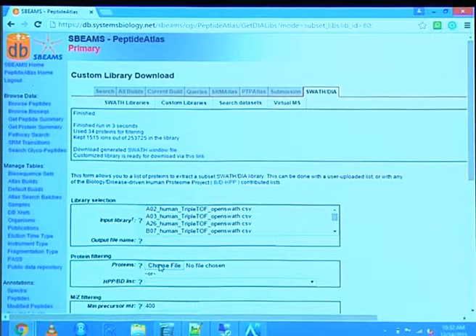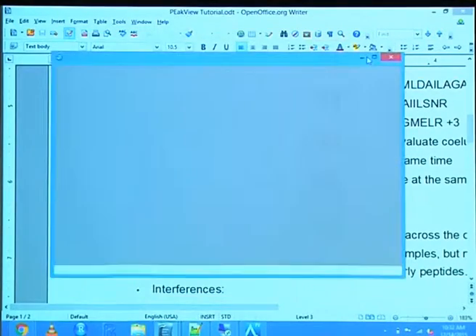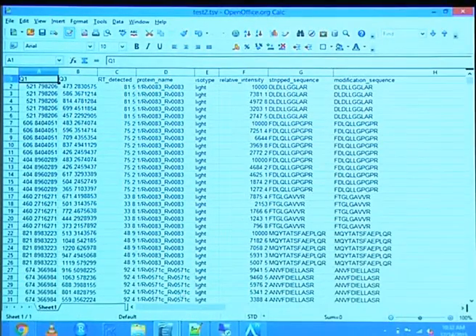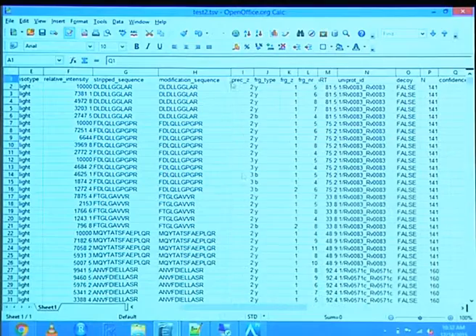So in that case, it would look like from 400 to 425, from 425 to 450, and so forth and so on. Or you can download the library. You click on that thing here. It does the trick, and now it downloads the library. And it's done. You can click on it, and then you can have a look at this, the library as it's supposed to look. Make it a bit smaller like this.